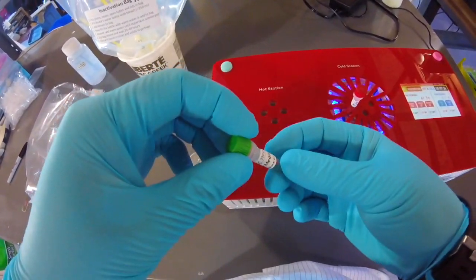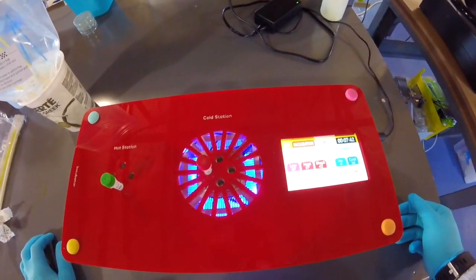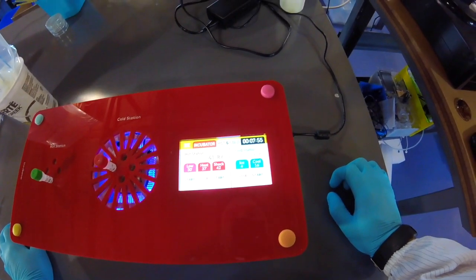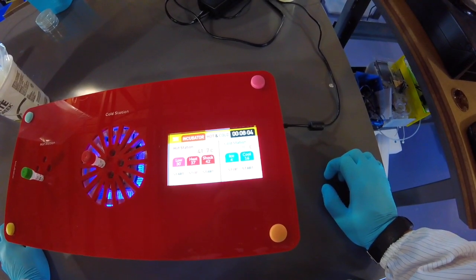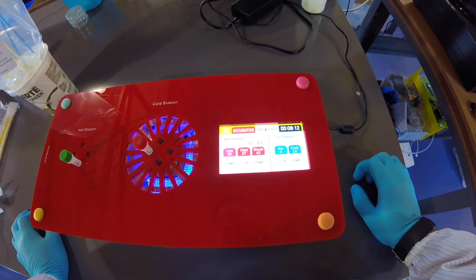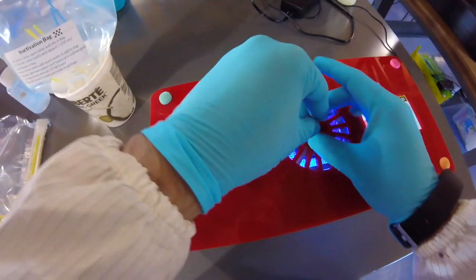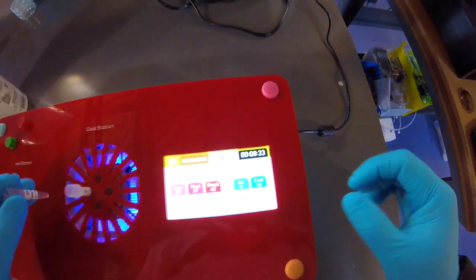Again, you want to try and make sure all the liquid is at the bottom of the tube, not in the lid, so that you get everything in there, or as much as you can anyway. Alright, so the cells and everything should be nice and cool in there. DNA should be trapped inside of the cells right now. I'm just going to get the tubes ready. I'm going to just take the lid off of our cells. I'm going to take the lid off of the recovery. We've reached the 8 minutes and 30 seconds.